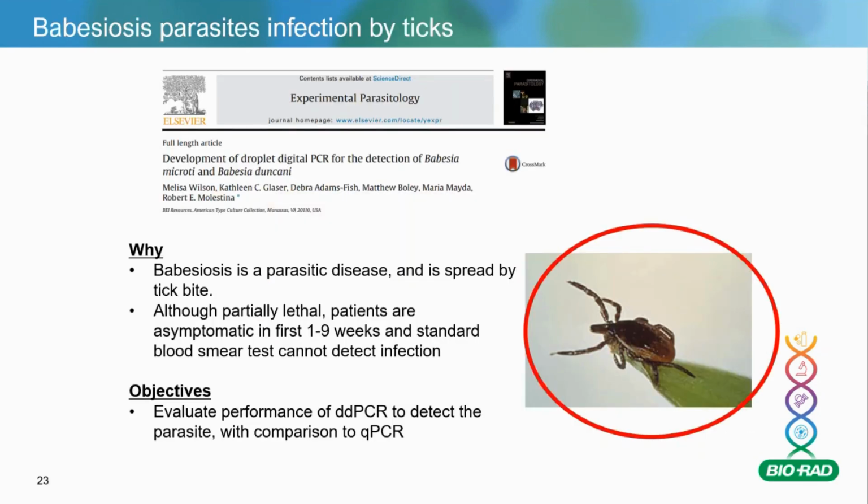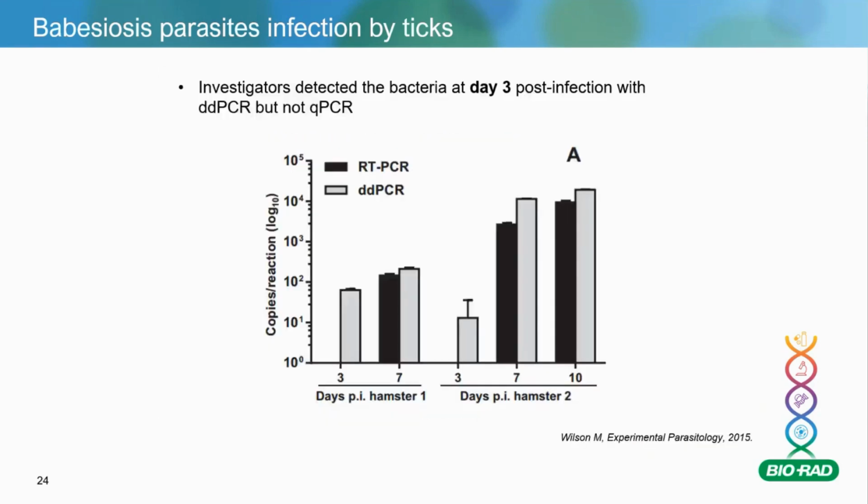And here, this is a totally different sort of application, but this paper was taken from ATCC. And I highlighted this specific paper because they demonstrated the lack of any viable diagnostic test for babesiosis, specifically for distinguishing strains. So they wanted to see if they could use ddPCR, comparing it to qPCR, and see the difference. And this is what the outcome was.